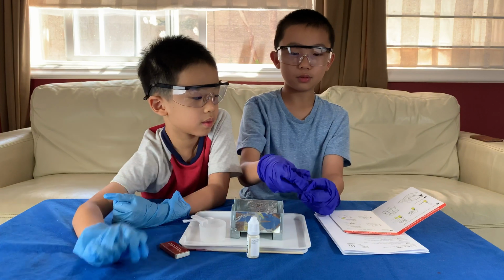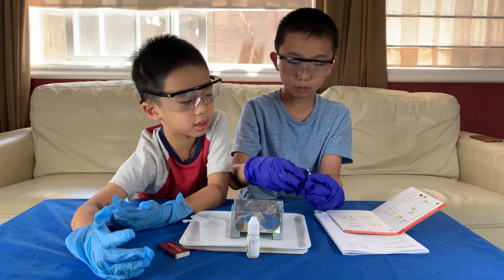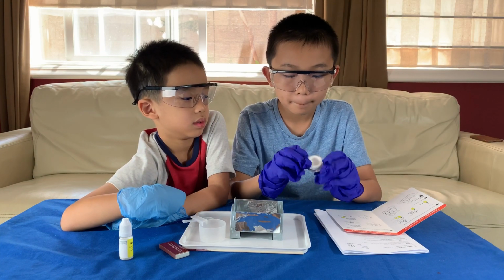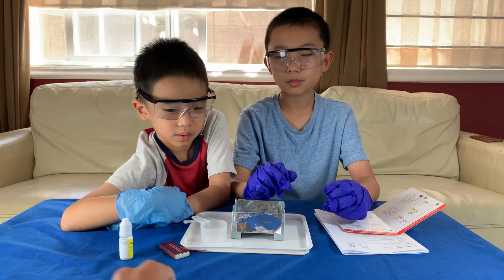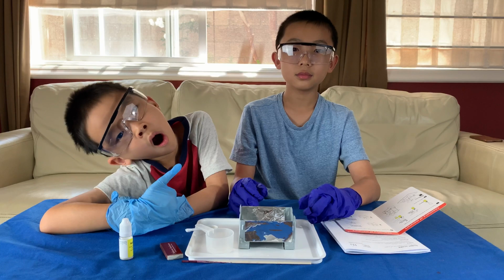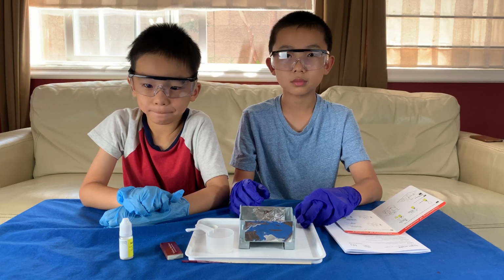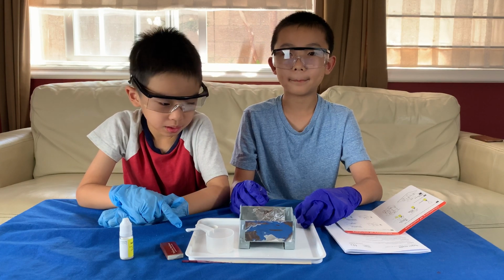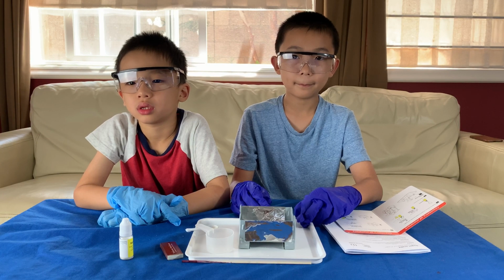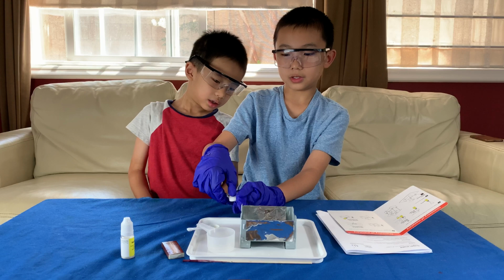But I thought we have to open. Yeah, we have to open it. Do we just open it? It's so dangerous. It's just we don't need it. Move that little bottle out of the way so it's not blocking that. Scissors. There, okay. Make sure not to touch the fuel. We now have a tablet of solid fuel.